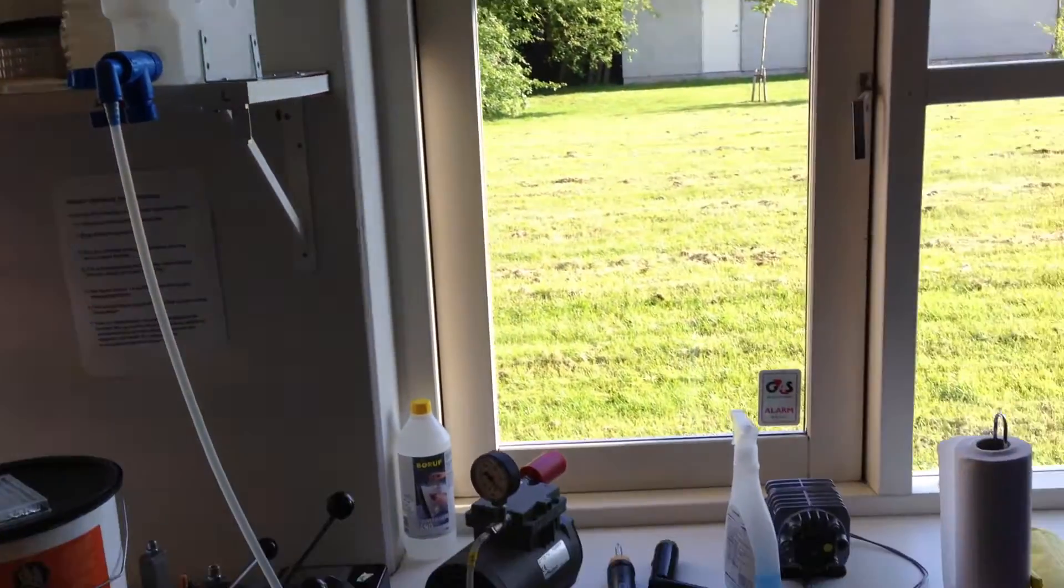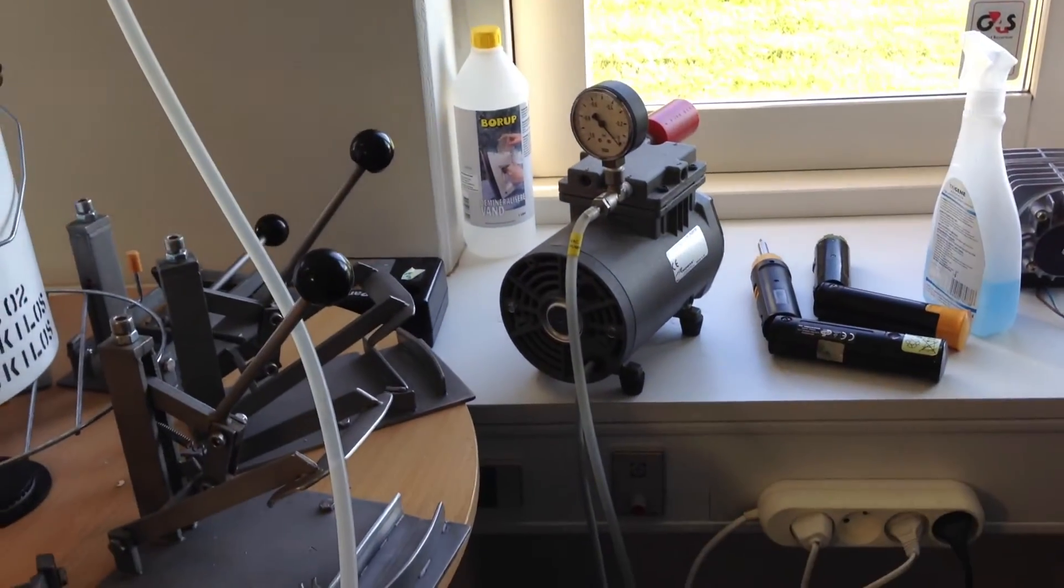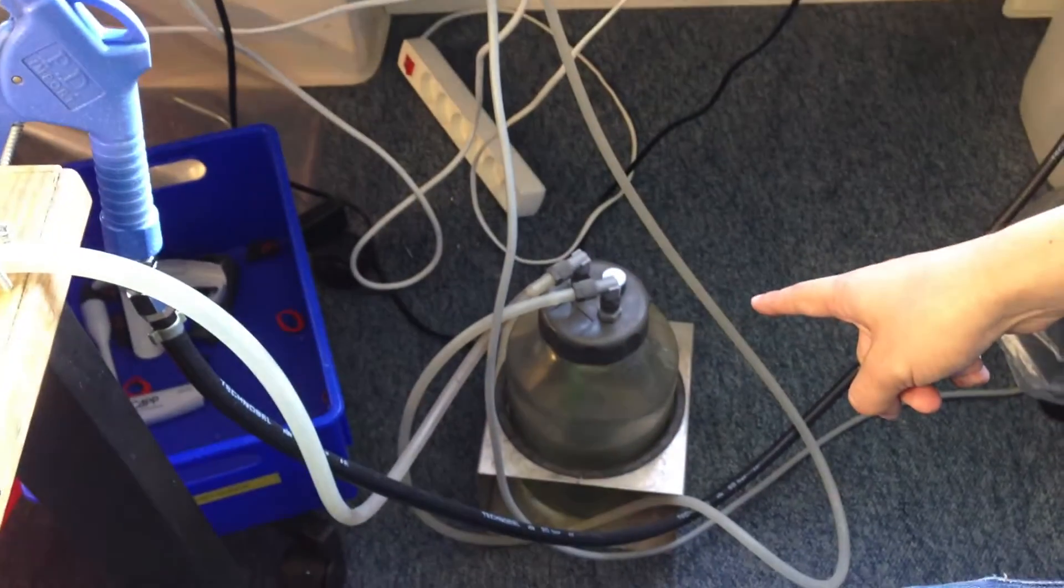Over here we have a vacuum pump, and down here we have a waste collection bottle with a trap.